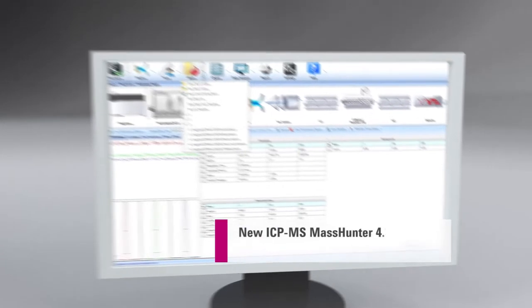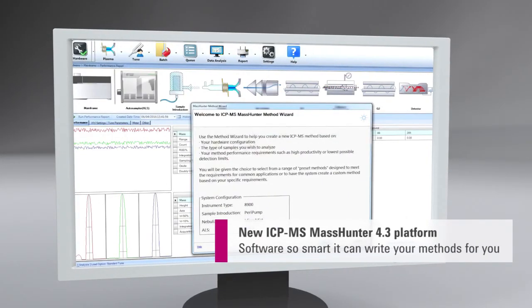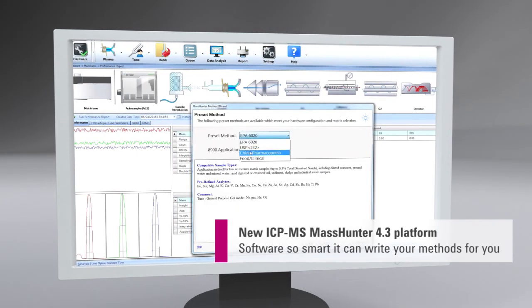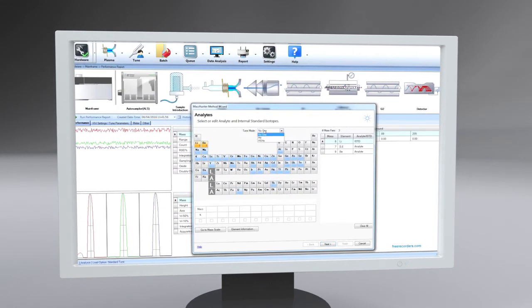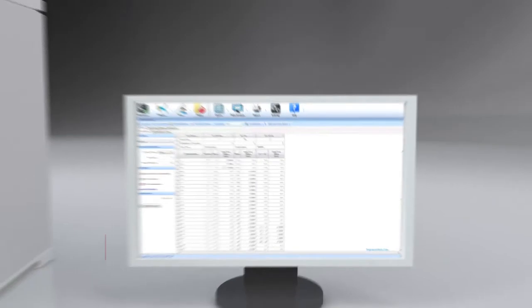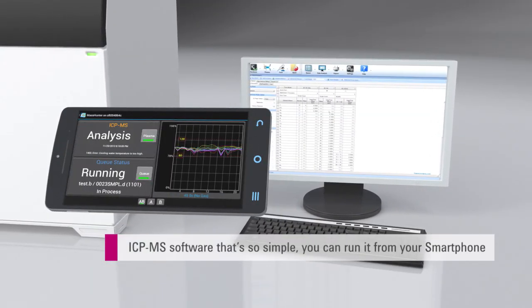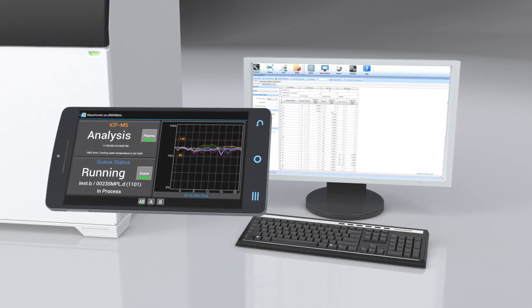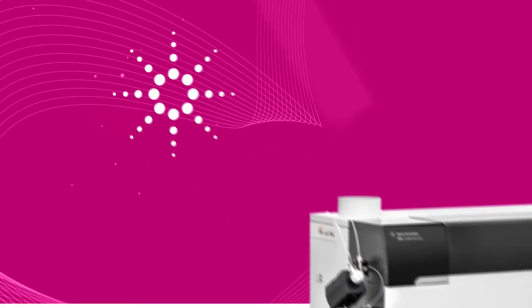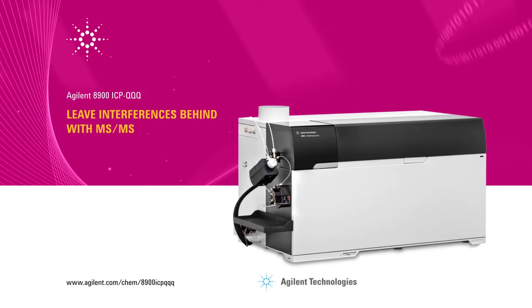The Agilent 8900 runs on Agilent's ICP-MS MassHunter software platform, giving fully integrated system setup, run control, and data analysis. ICP-MS MassHunter includes the innovative Method Wizard, which builds a working method based on your sample type, and the remote control app that lets you view and control the ICP-MS from your smartphone. Leave interferences behind using MS-MS with Agilent's second-generation 8900 ICP triple-quad — interference removal has never been so reliable or so easy to achieve.